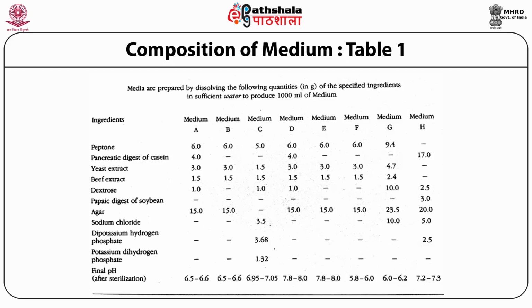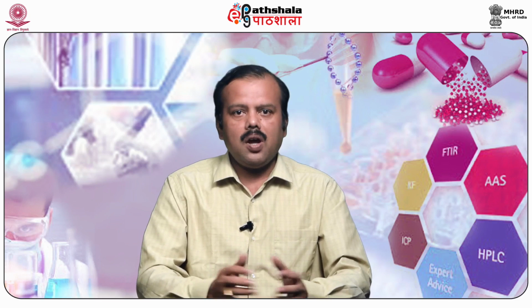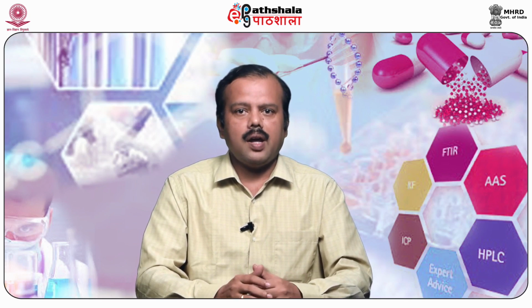Agar is used when we need a solid media, whereas for liquid media, for example in medium C, we do not use agar because agar is a solidifying agent. The liquid media is most commonly used for method B, that is the turbidimetric method, whereas the agar containing media are most commonly used for the cylinder plate method.